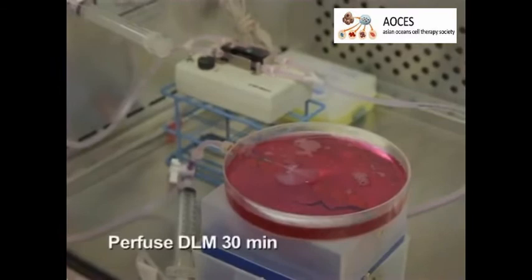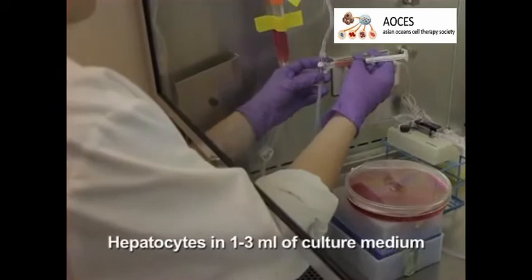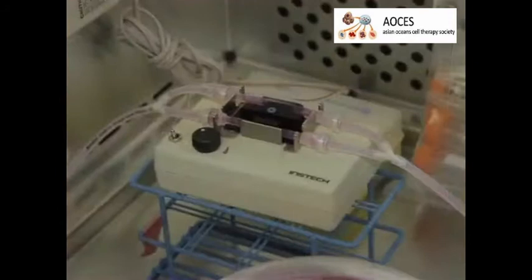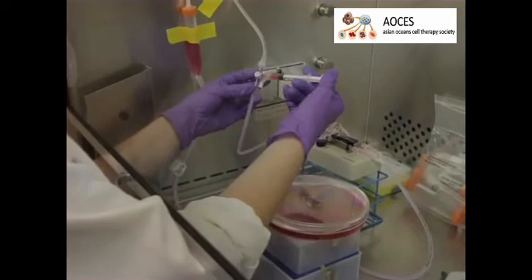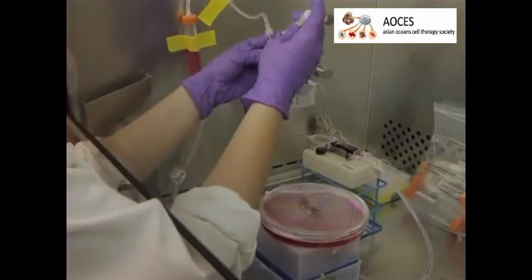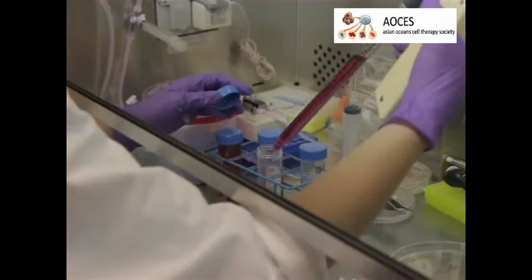Next, stop the flow in the perfusion system and slowly inject 50 million hepatocytes that have been isolated from an adult rat into the perfusion system through the bubble trap. Restart the flow at 10 milliliters per minute and recirculate the medium for 10 minutes. Stop the flow of medium again, inject an additional 50 million hepatocytes, then restart the flow again at 10 milliliters per minute. Repeat this procedure until a total of 200 million hepatocytes have been introduced into the DLM.